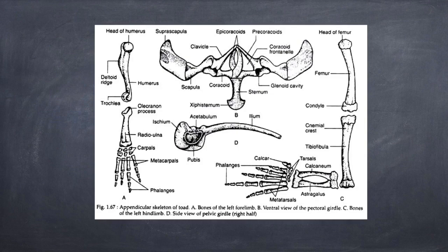For the appendicular region, the first part is the forelimbs, the anterior appendages. Each limb is divided into segments which correspond with our forelimb. These segments are as follow: the upper arm, middle forearm, carpus or wrist, manus or hand, fingers, and prepollux.